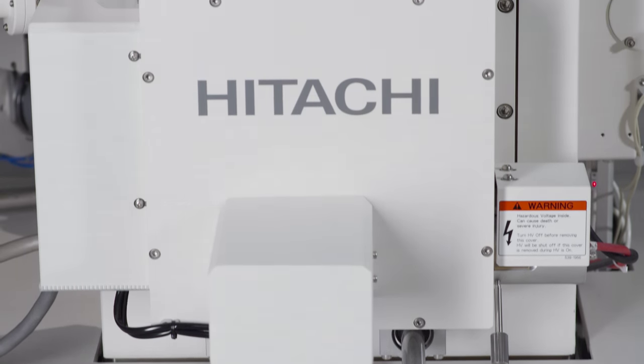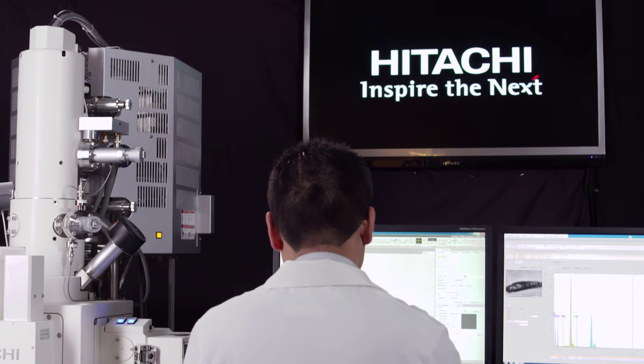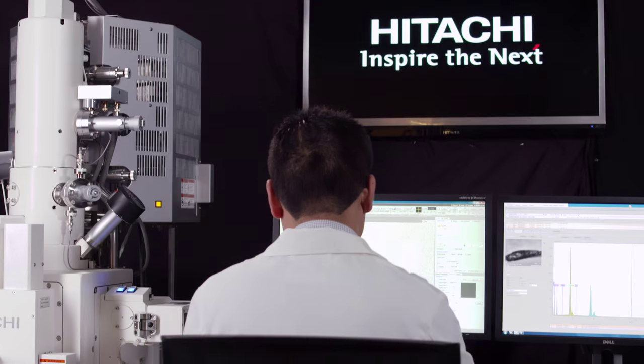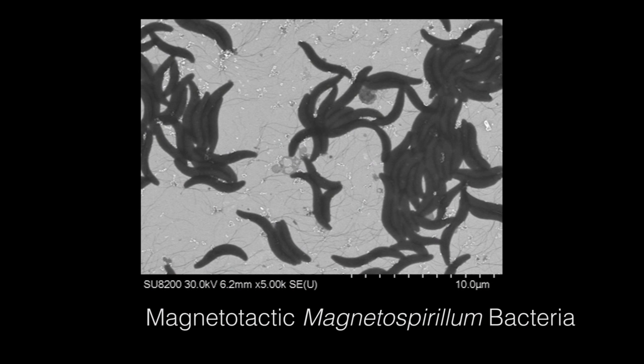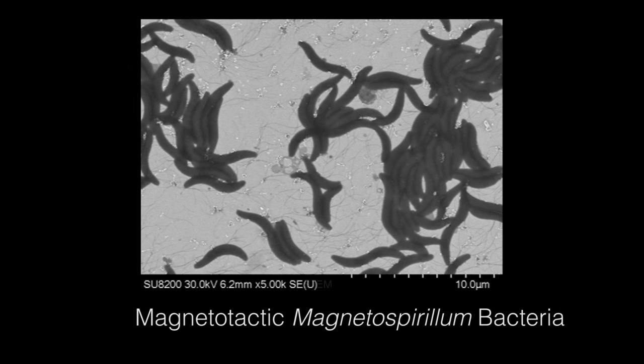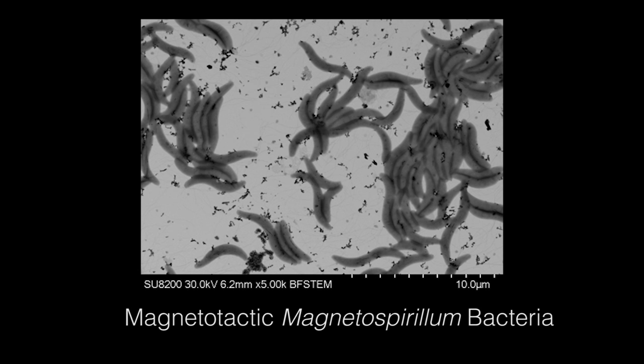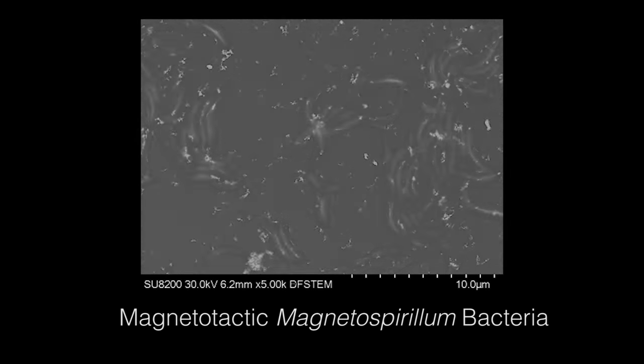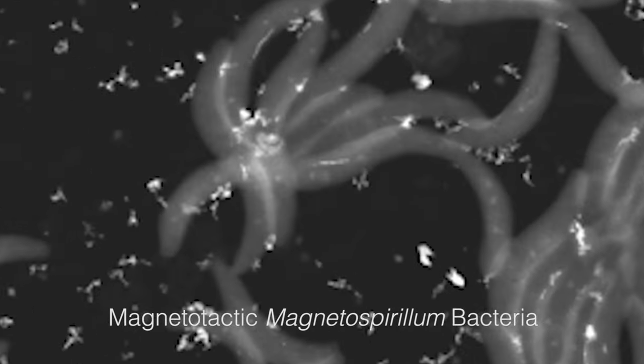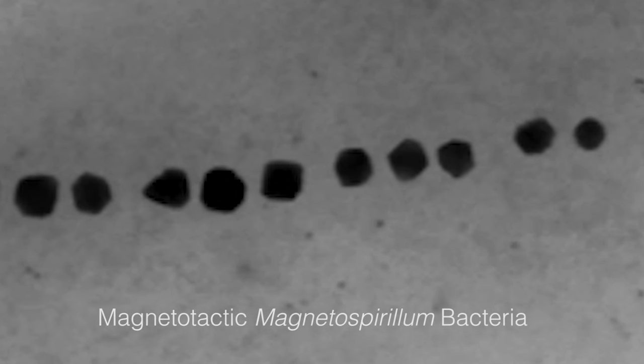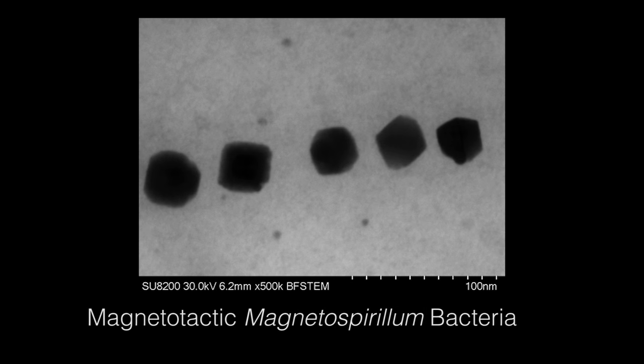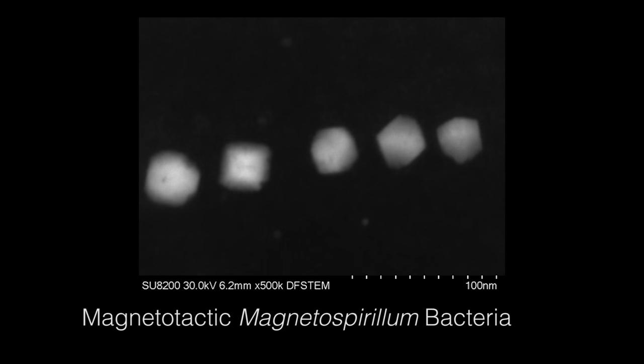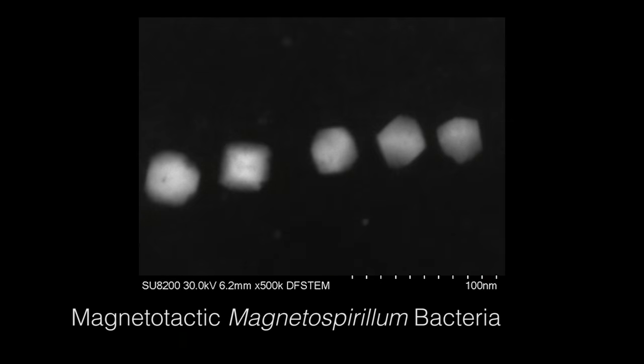A STEM detection device is also available on the SU8200 series, which provides internal specimen information that can be obtained simultaneously along with the secondary electron image. Additionally available is a bright field STEM aperture that works to deliver enhanced resolution, as well as contrast differentiation when imaging materials of similar densities.